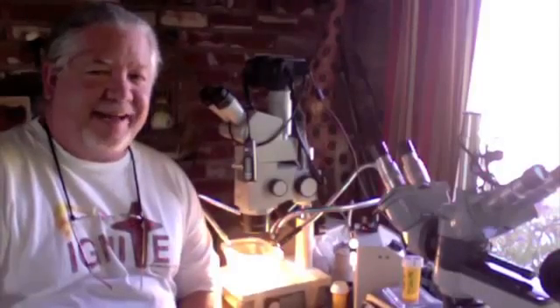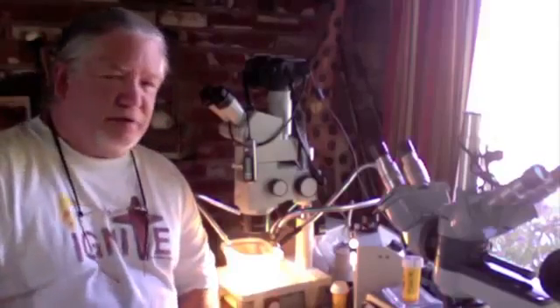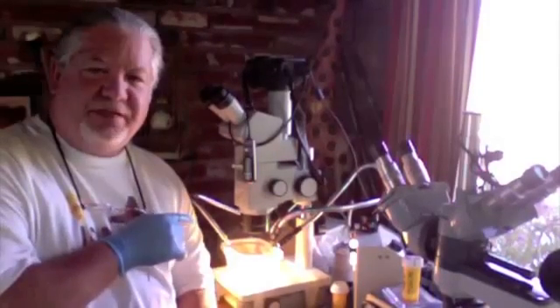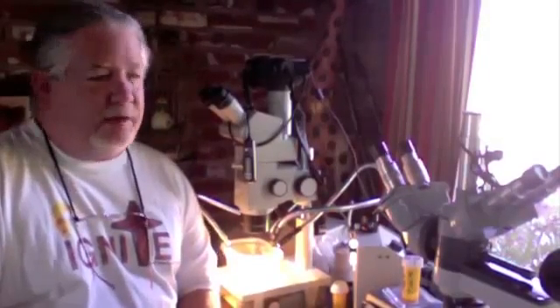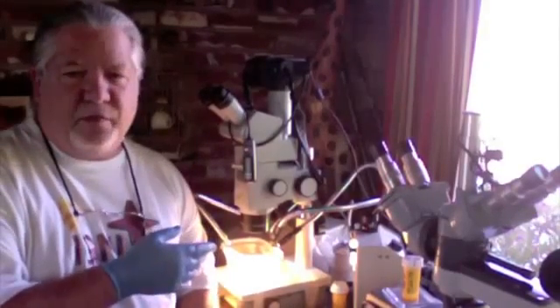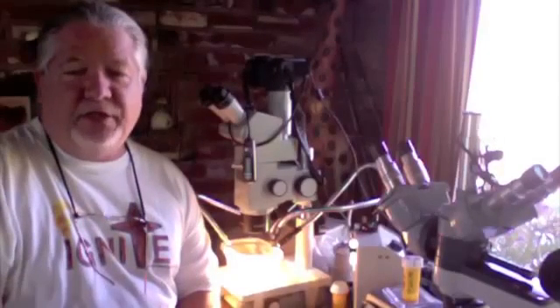I'm looking at something very exciting: dinosaur bone in my dissecting microscope. This is bone that I have put through what's called a decalcification process, and I'm actually seeing the soft tissues left over after the bone mineral has been decalcified or taken away. This is very exciting, of course, because dinosaurs are supposed to have lived and died some 65 million years ago, and yet we still find soft tissues in their bones. This happens to be a triceratops horn that we dug out of the Hell Creek Formation in Montana.